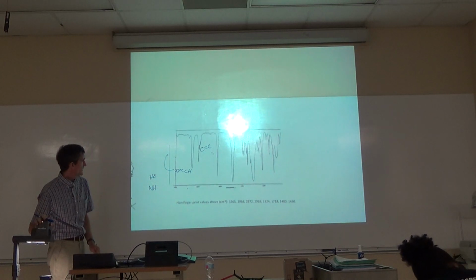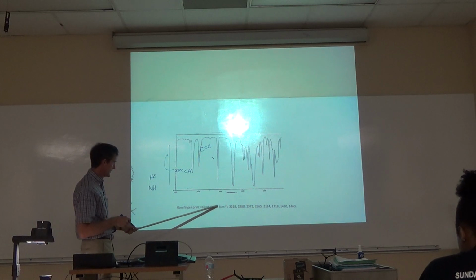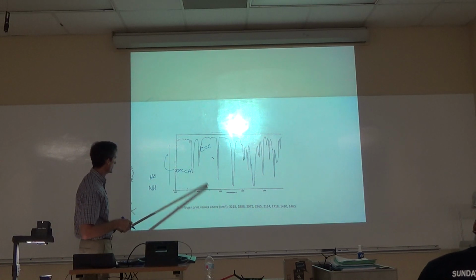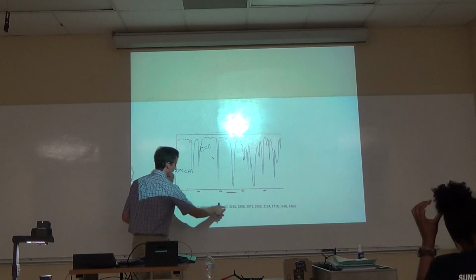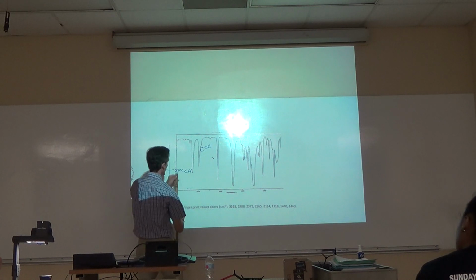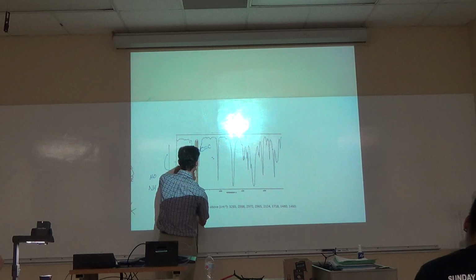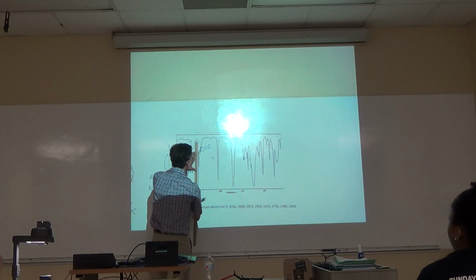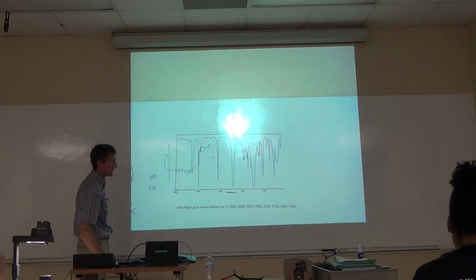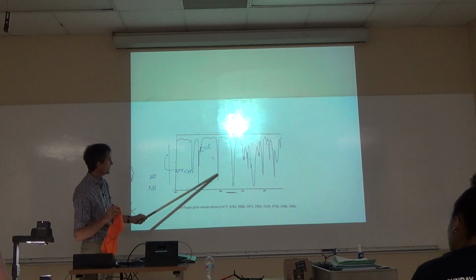One on the side over here. Non-fingerprint values above, giving you peaks here. 3265, 2988. So that tells you that this peak here, it's labeling these peaks. What do you see here? There's no sp2CH. A couple strong peaks here.